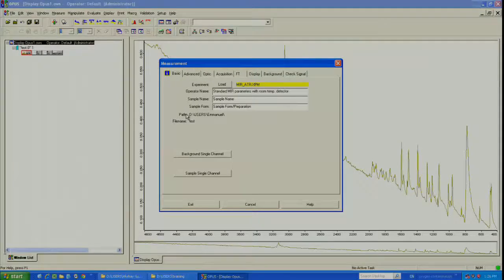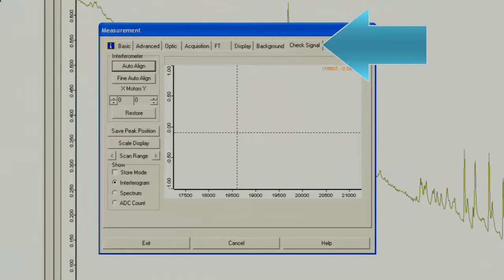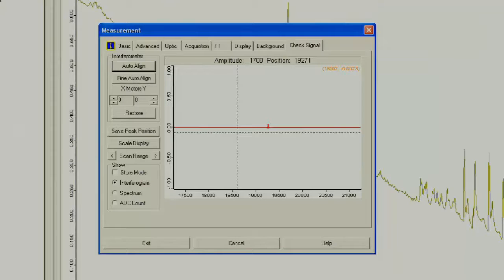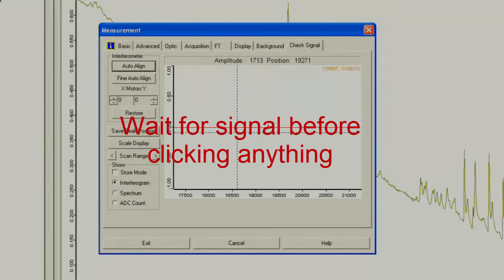Another way to check that you are at a stable condition after evacuating the bench is to use check signal. Again, after you click the check signal tab, do not click anything while waiting for the signal to appear. When the signal does appear, you can look at the amplitude. If the amplitude is not changing very much, and is still in your desired range, then the system is stable.